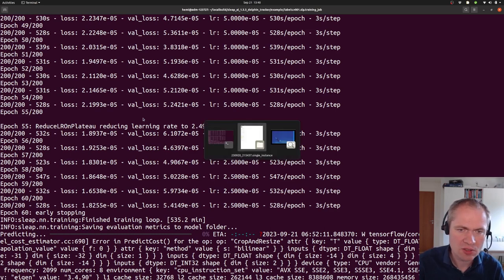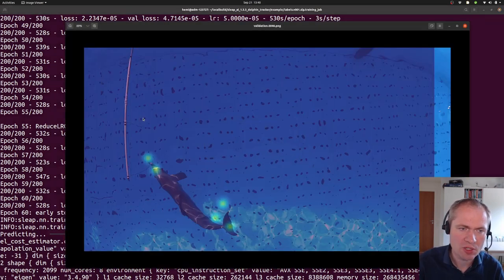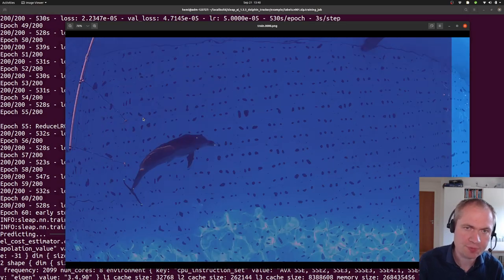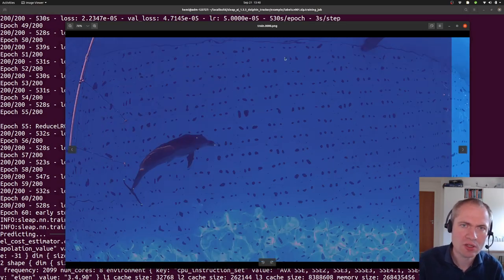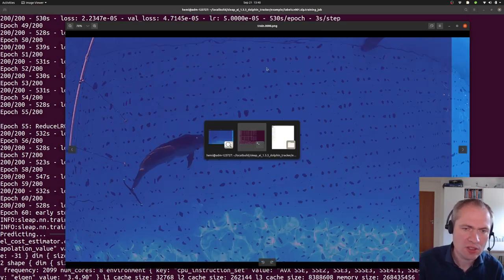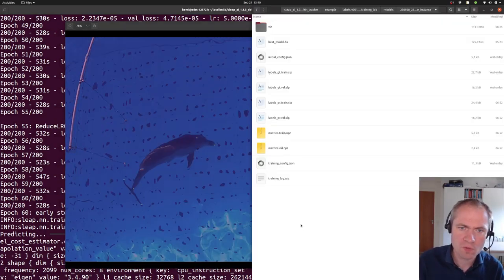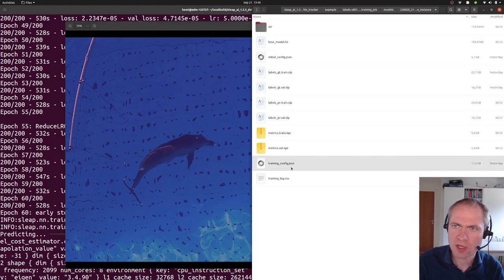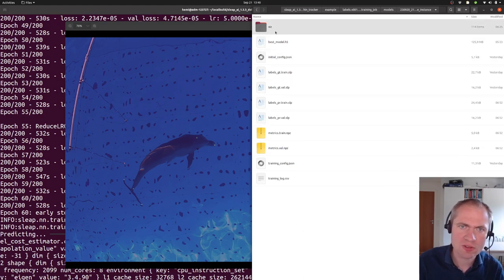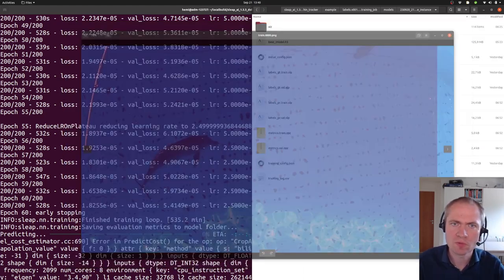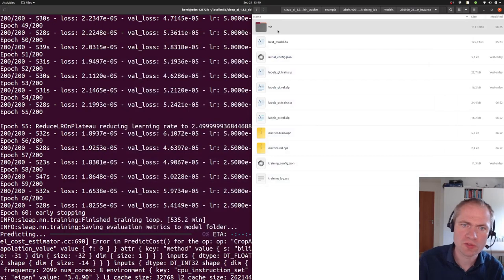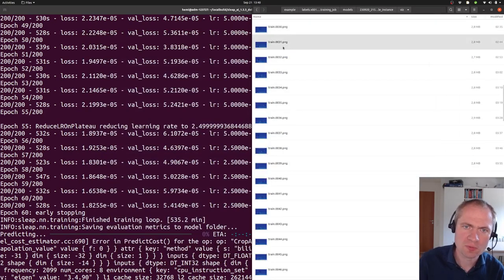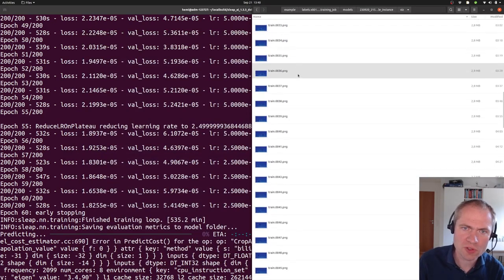Let's take a look at what actually comes out of this. Inside the folder where we have the different things, we also have this visualization directory.